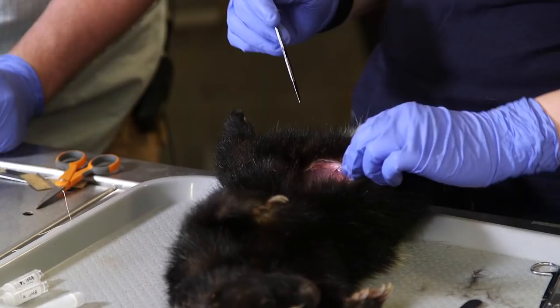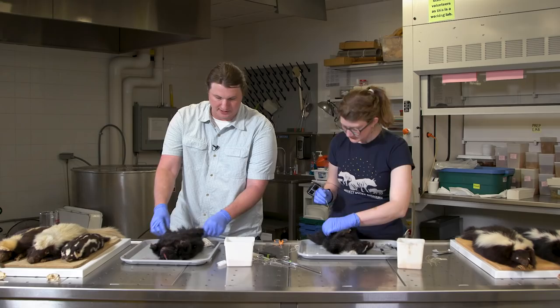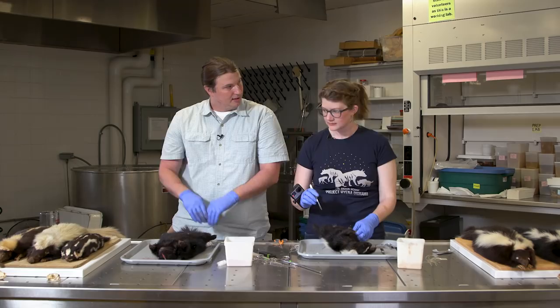What we'll do is first work like we do with a small mammal — we want to get the hind legs out. Then we'll cut the hind legs off, pull them forward, and that's when we'll start peeling away around the anal glands, excavating them.